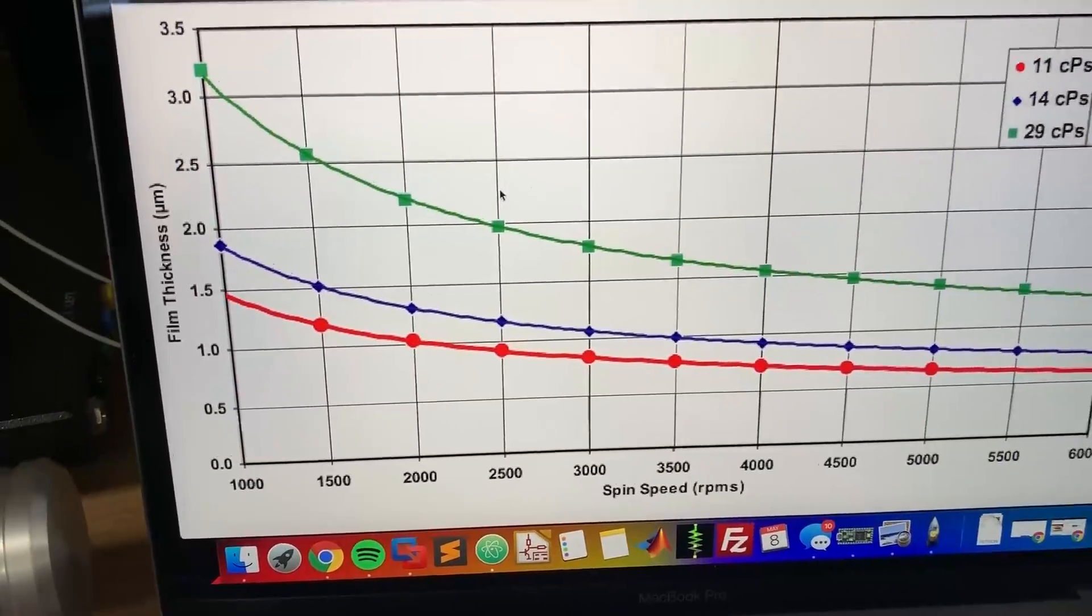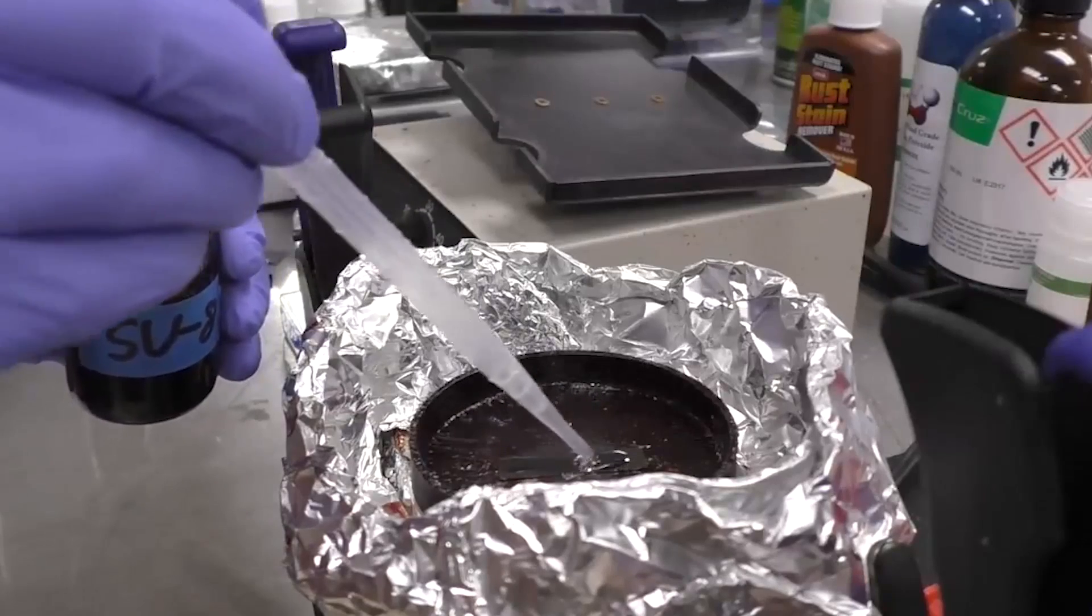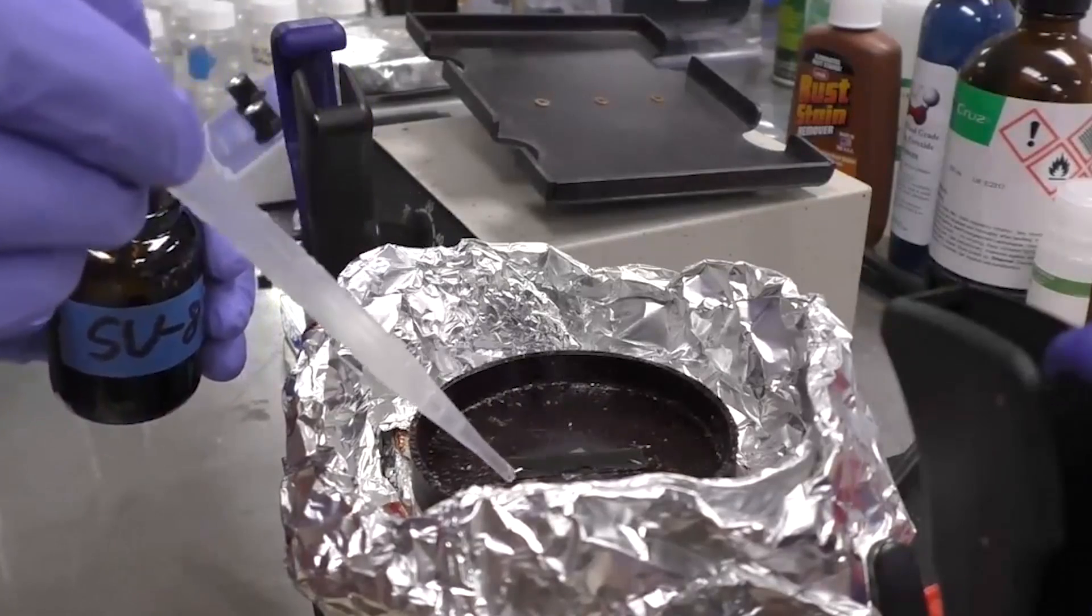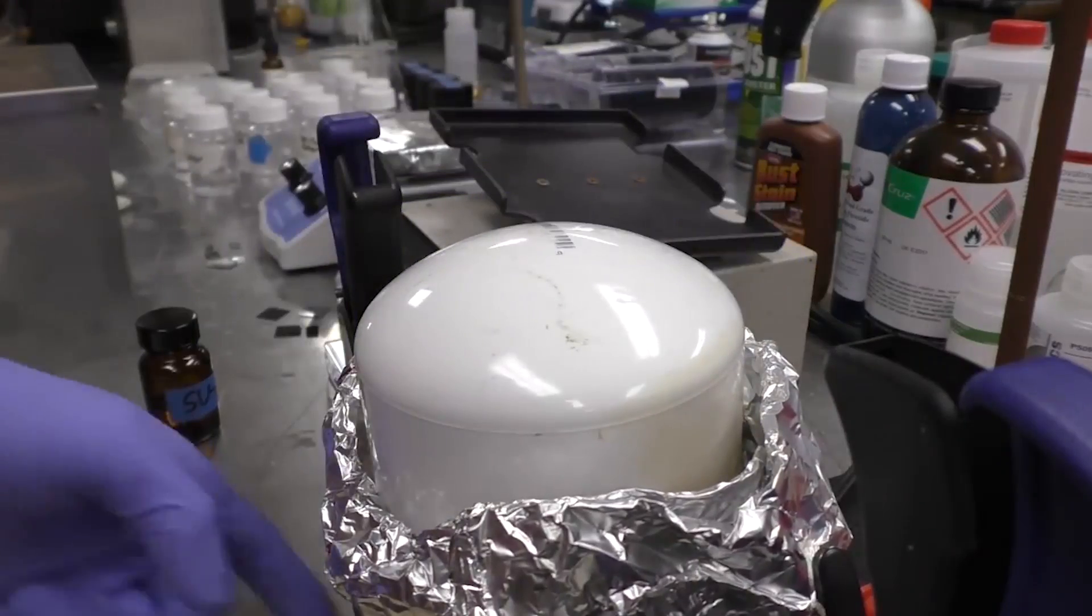The photoresist was spin coated and it's a pretty easy way of getting a calibration standard with a liquid of known viscosity. If you spin it onto the wafer at a known rpm then you should get a pretty repeatable thickness.